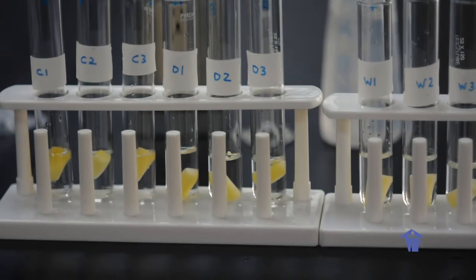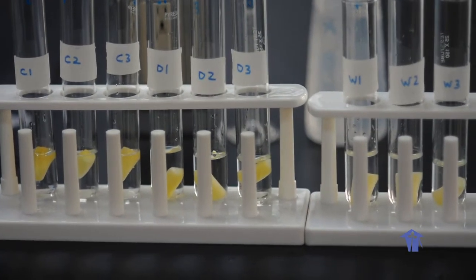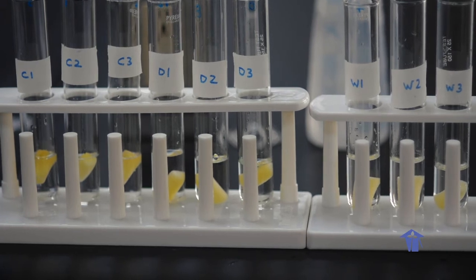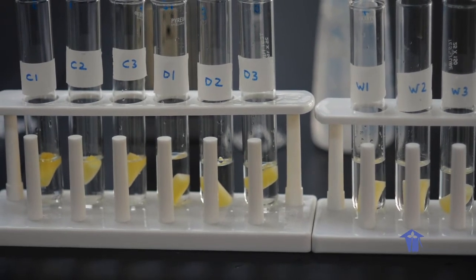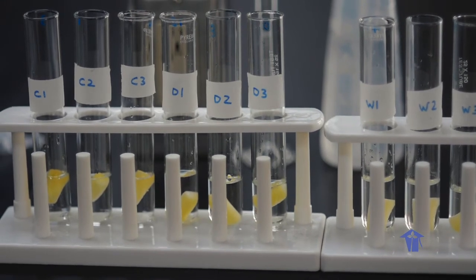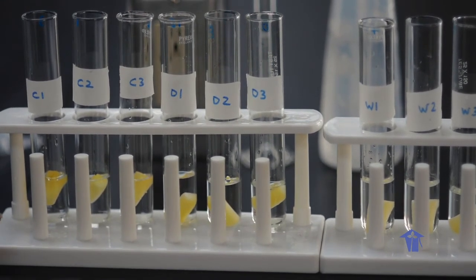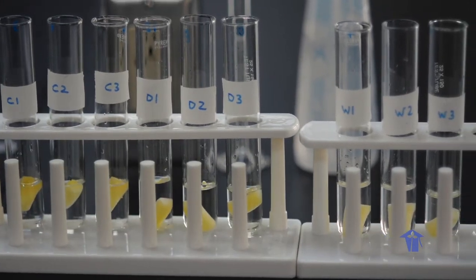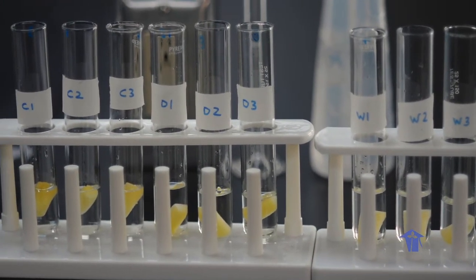And when we come back, we're going to take them out, put them back on the pieces of tissue and allow them to dry out a little bit by patting them dry, and then we're using our rulers to get measurements of the length and the diameter of the potato strips at the end of our experimental period.